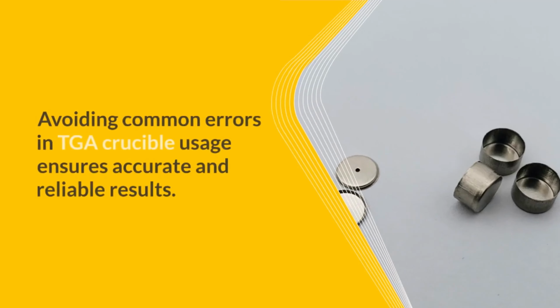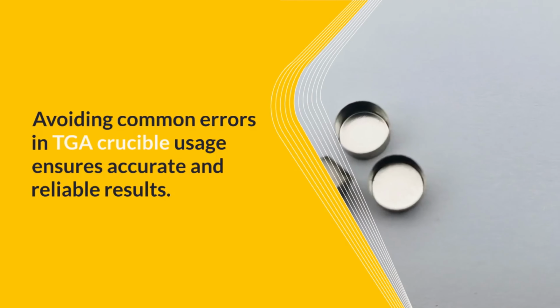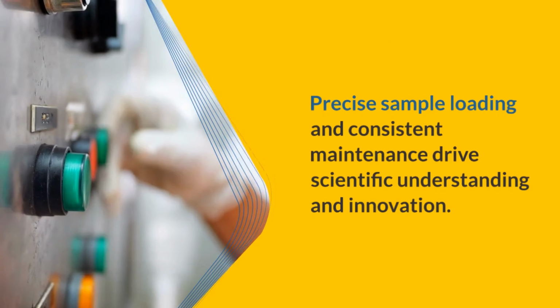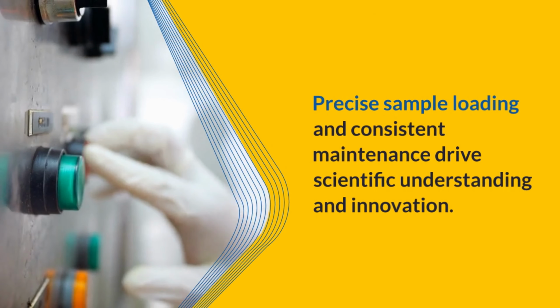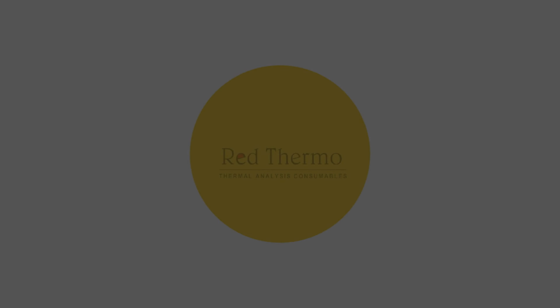In the realm of thermogravimetric analysis, the quality of results hinges on meticulous crucible usage. By avoiding common errors, like selecting the wrong crucible material, mishandling crucibles, and neglecting proper calibration, researchers and industry professionals can ensure accurate and reliable TGA outcomes. The careful selection of crucible material, coupled with precise sample loading and consistent instrument maintenance, sets the stage for meaningful analyses that drive scientific understanding and innovation.